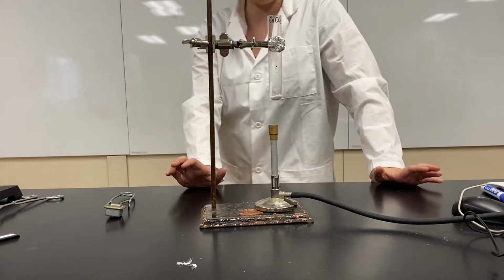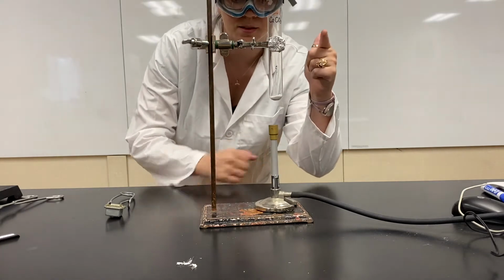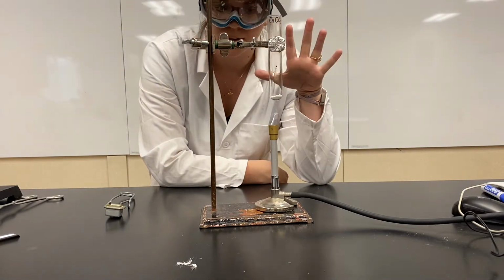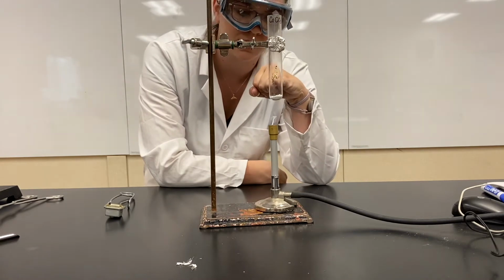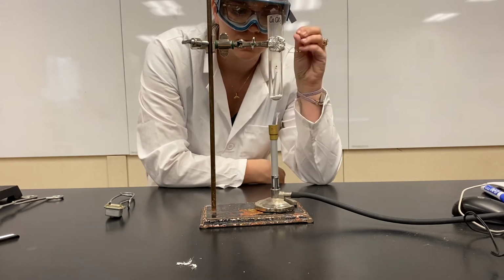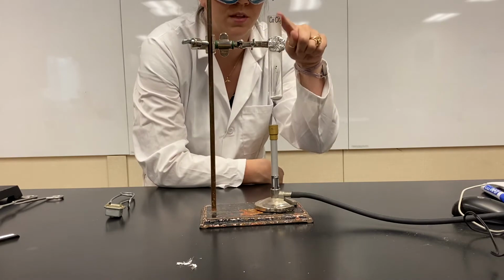We will heat up our calcium carbonate. You can hear it. I don't know if you can hear it through the phone, but you can hear there's like a little crackling. Something is definitely happening. You can see that the little granules of calcium carbonate are changing, okay? You can definitely see condensation within the test tube.